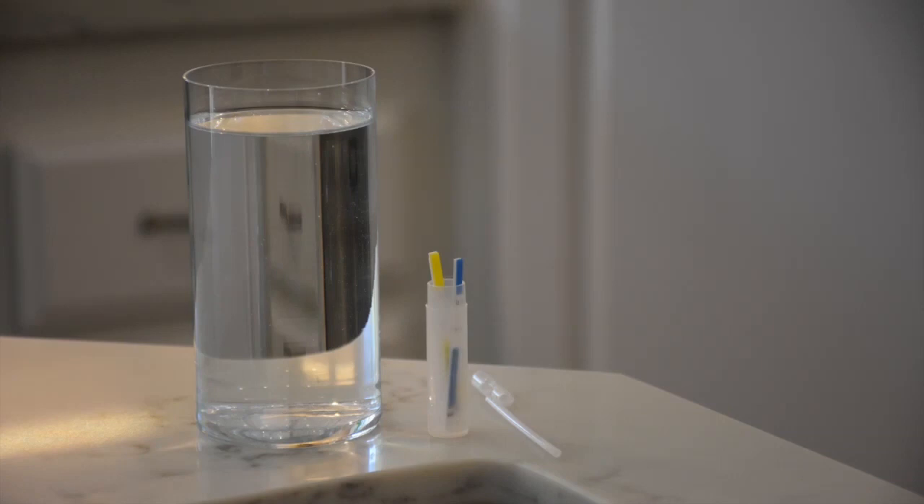To carry out the lead and pesticide test, remove the test vial, dropper pipette, and two test strips from the package. Using the pipette, place exactly two pipettes full of water into the test vial.